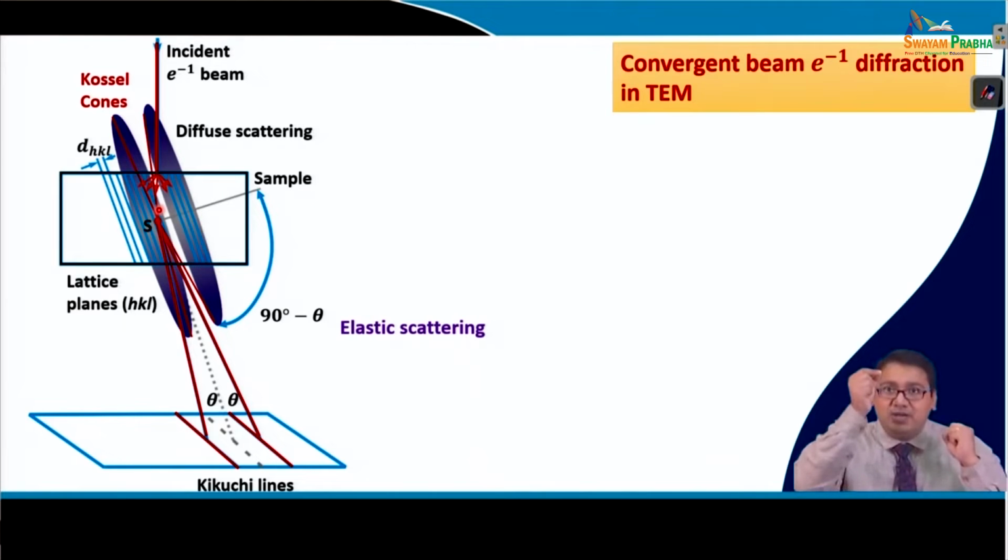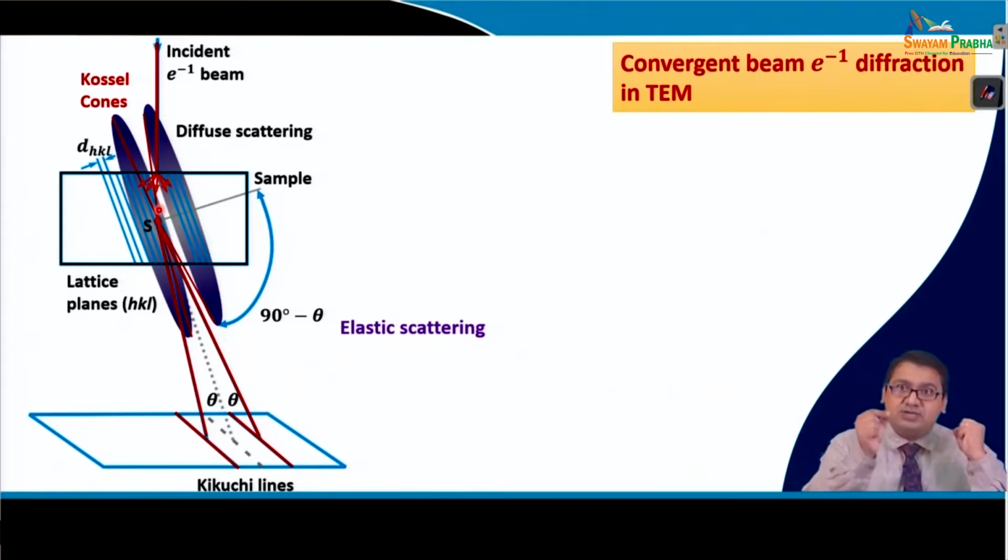How is it? One electron is falling and is scattered one time. Say, for example, it goes in this direction and then it is scattered another time and goes in this direction. Now, multiple electrons are falling from the electron beam, and they scatter multiple times from millions of atoms present in the metal. So the scattering takes place in all possible directions, 360 degrees in space, and therefore the electrons seem to come at all possible angles from inside the sample.